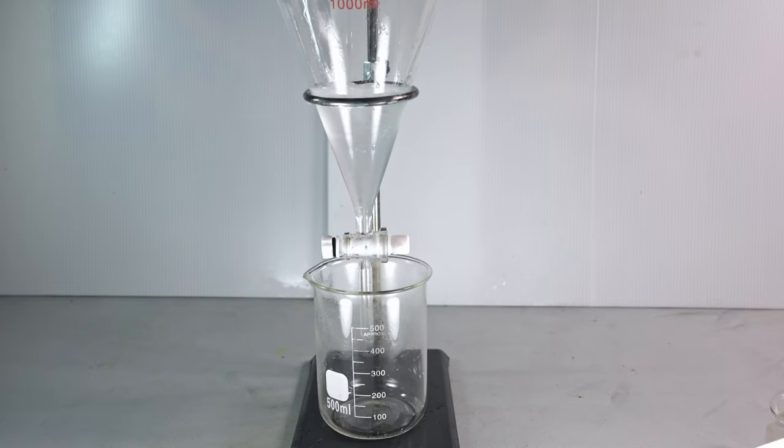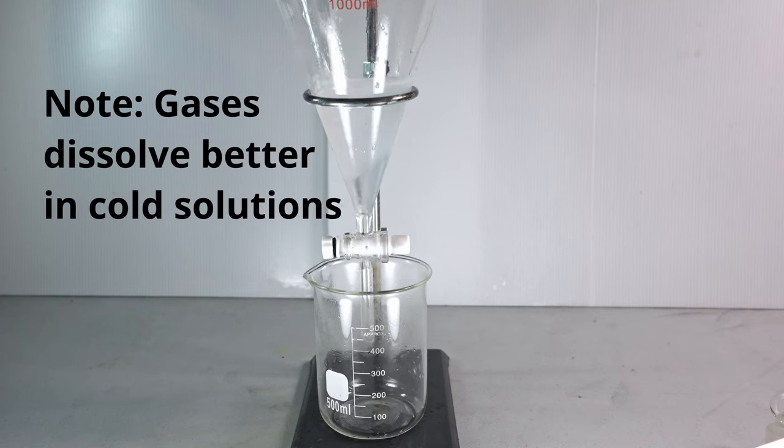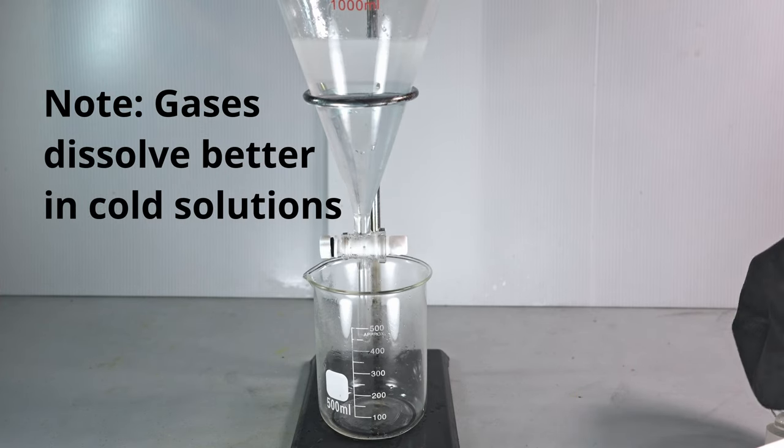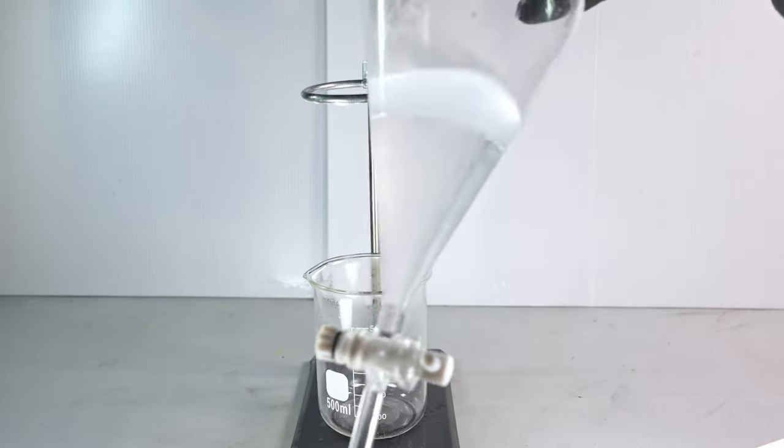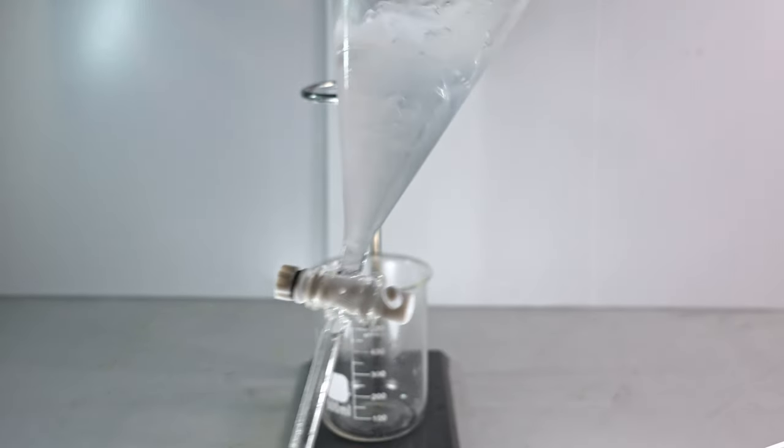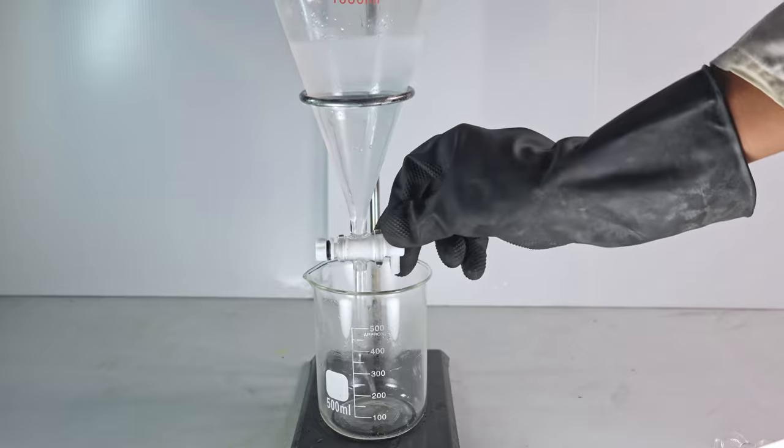The next thing we do is pour in some cold water. Because it's cold, it's going to absorb any extra hydrogen chloride that is dissolved in the solution. Shake it up a little bit and we're going to put it back on and drain.